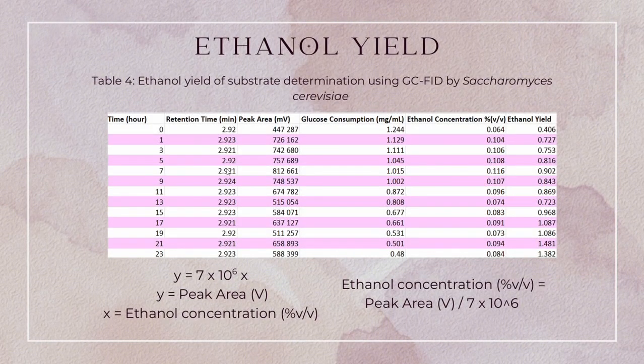Next is regarding the ethanol yield. Table 4 shows the ethanol yield of substrate determination using gas chromatography flame ionization detection by Saccharomyces cerevisiae.